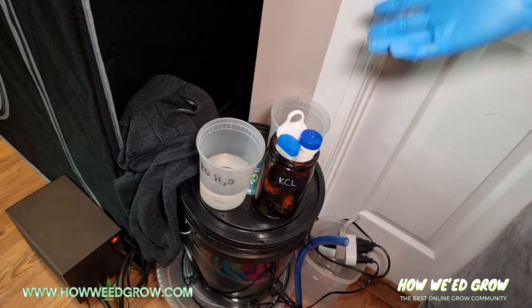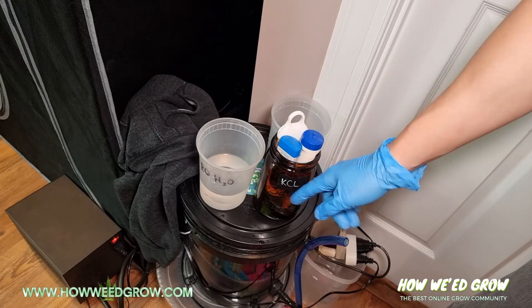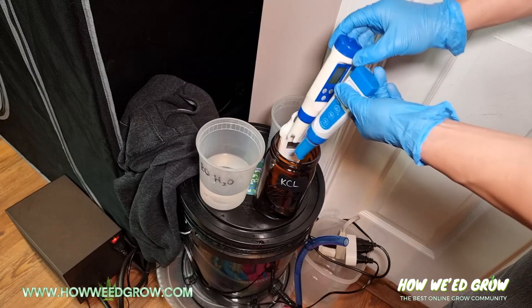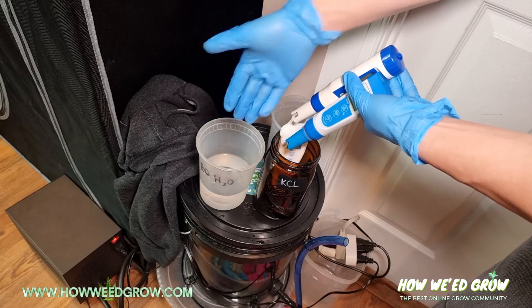So here's how you properly use your pH meters. You always want to store it inside KCL solution. Once you take it out of the KCL solution, you want to rinse the probes in RO or distilled water.